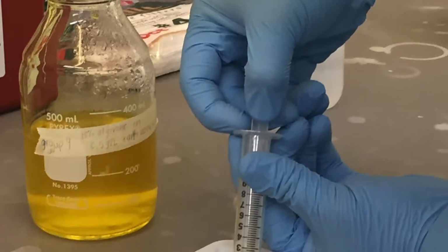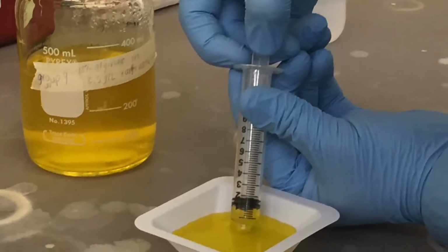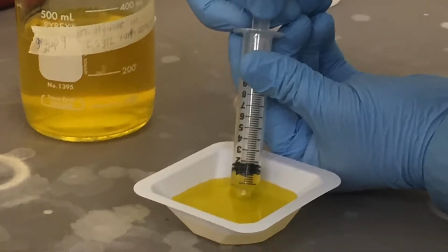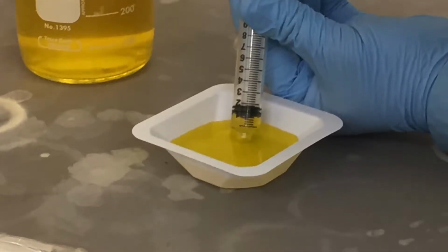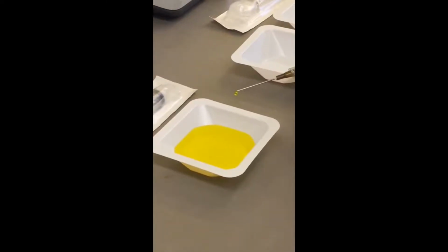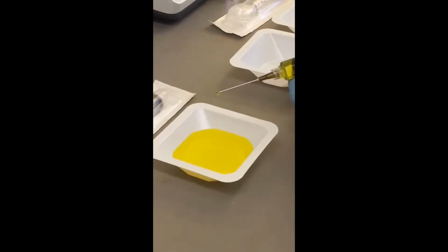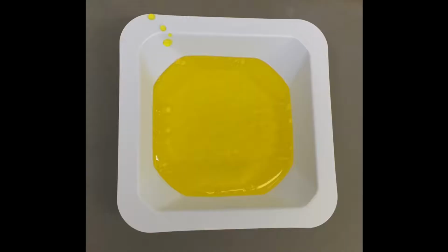The next step in the experiment was to create the beads that would be used to deliver the tartrazine. 30 milliliters of 6 weight % calcium chloride solution and 3 milliliters of alginate solution were measured out. A syringe tip was placed on the end of the syringe, and the alginate solution was then added to the calcium chloride solution by slowly releasing individual drops. Once all the alginate solution was added to the calcium chloride solution, the mixture was left to sit for 5 minutes to allow the beads to cross-link.